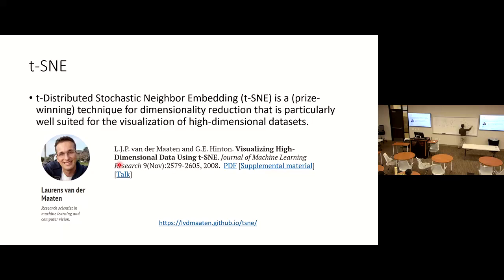Remember this is the T distribution. So when I learn the relationship between 2 points, I use the distance between these 2 points in the high dimensional space and define their relationship, which gives me the relative possibility to be neighbors like this.